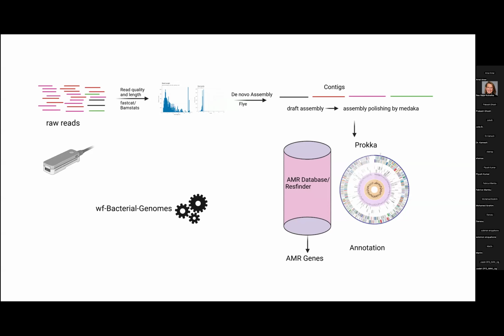And if you do any work on functional genomics, like the non-coding regions, coding regions, and the function of the genes, and we'd like to predict new genes, that is the function of this tool. So our focus is ResFinder because we'd like to detect the AMR genes.